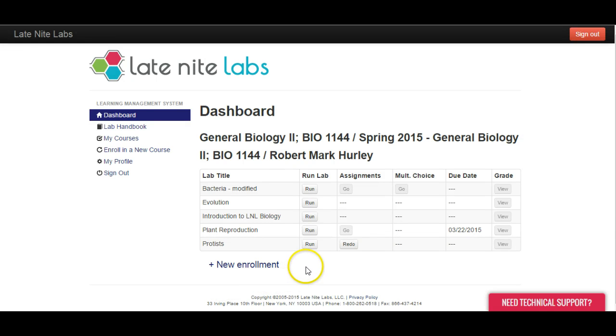Hello, we want to run through the Plant Reproduction Lab or Plant Reproductive Structures Lab. So right here's Plant Reproduction Lab. We're going to go over here and click on Run, open up the lab.